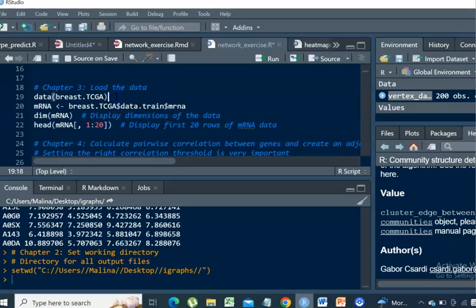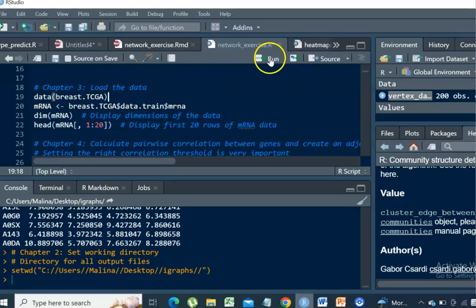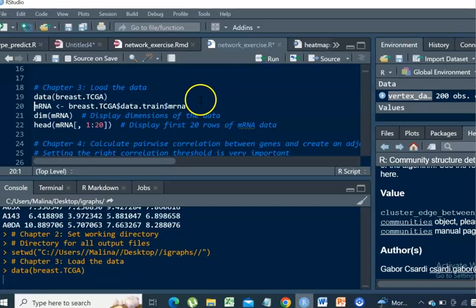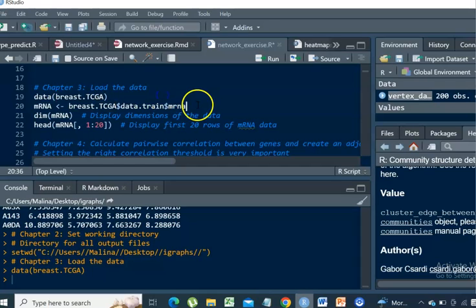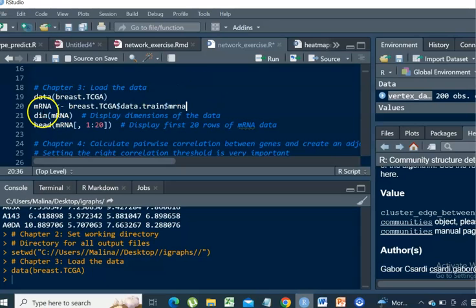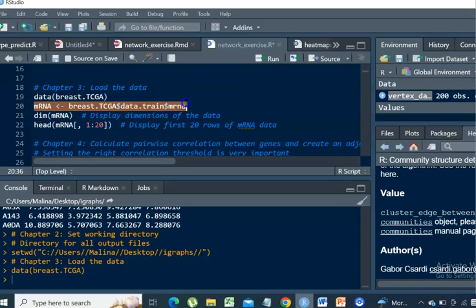The data: we can simply load it by running this command. This dataset actually contains quite a lot of different types of data. In order to query specifically the mRNA breast cancer data, you need to run this.